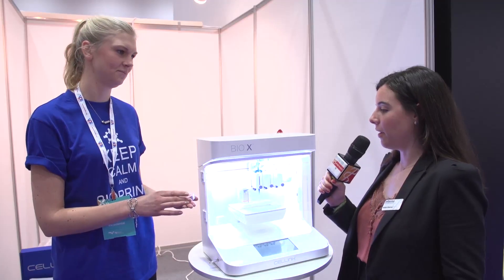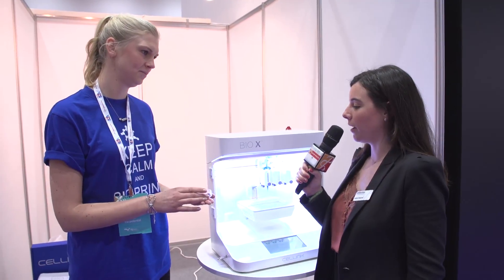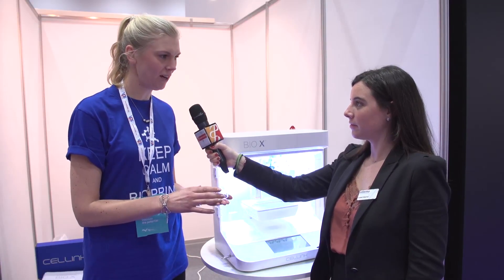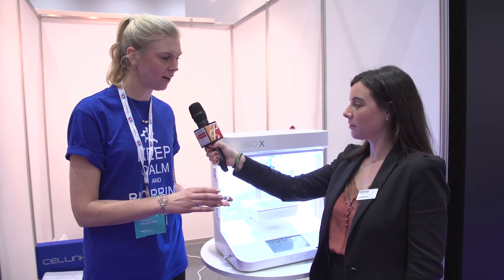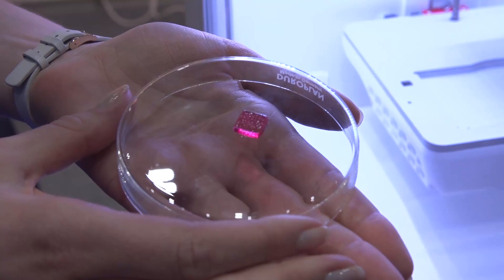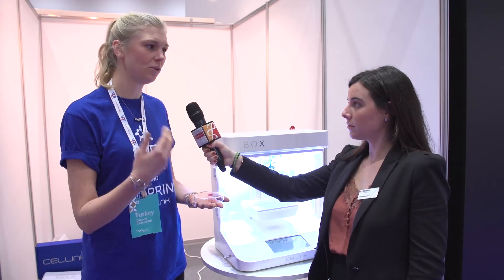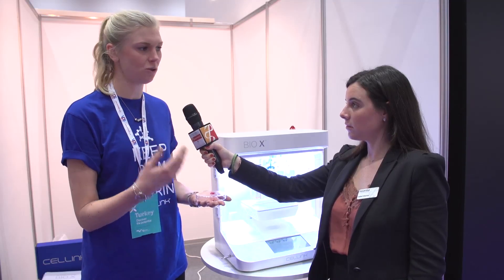Okay, so now we have our module printed. Hannah, can you tell me what can we do with this? So this type of model, we have a lot of cosmetic companies printing. In the European Union, it's not allowed to test on animals anymore, so they want an alternative method to try their products on.